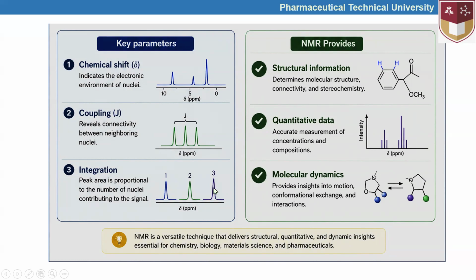If the number of some carbon atoms is higher in one compound compared to the carbon that belongs to another functional group, the higher number of carbon or hydrogen makes a peak with a higher peak area.